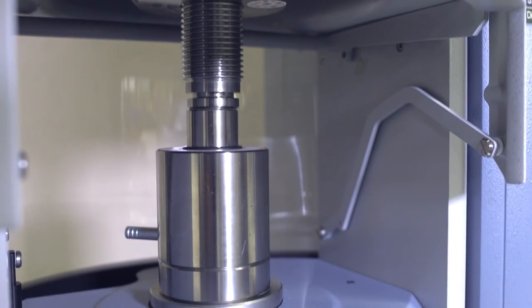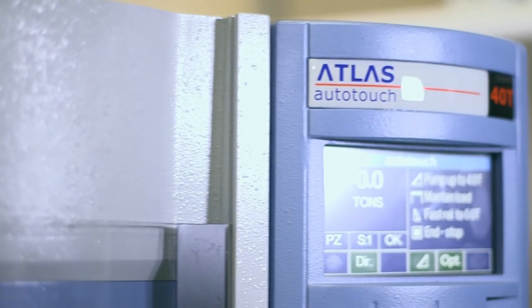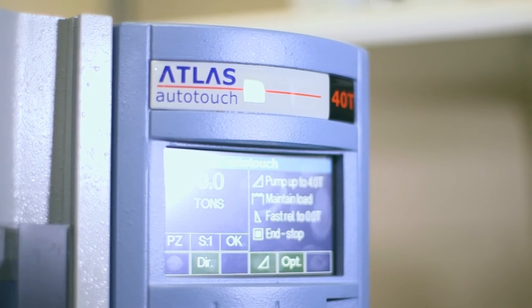For some applications where you really need a high quality pellet, we offer three different types of release rates once the sample has actually been pressed. As well as the most commonly used fast release option, the Autotouch also offers medium release and slow release. The difference between the fast release and the slow release is approximately 10 seconds.